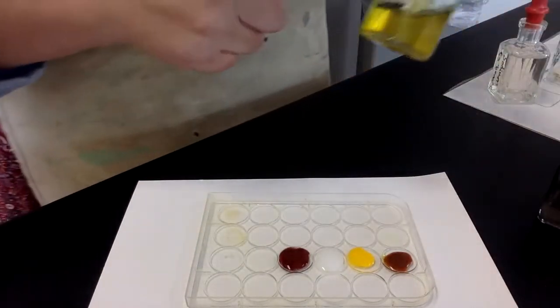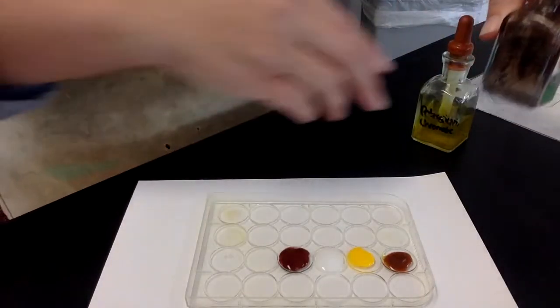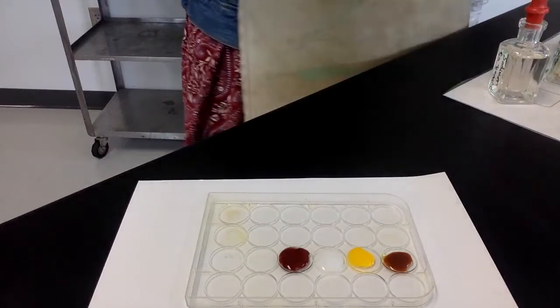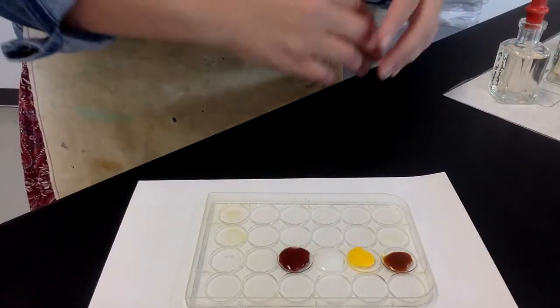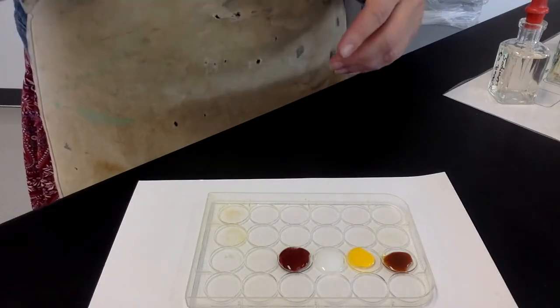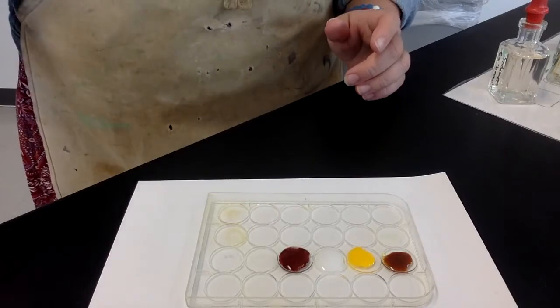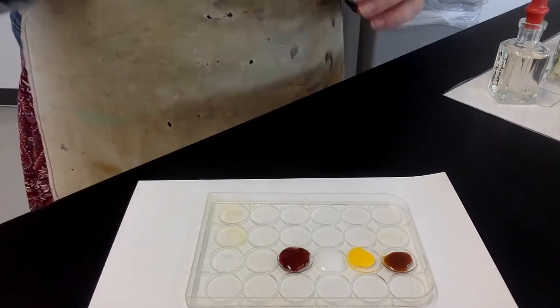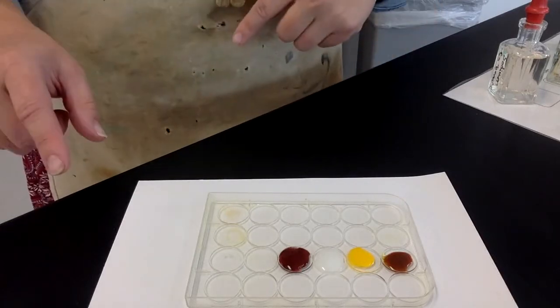Your 4 ions are potassium and chromate, silver, and nitrate. So those are your 4 ions. Write the original formula, switch the partners, and then you write the new compound. The new compound that is with NO3 is soluble because nitrates are always soluble. The other compound that's not with NO3, the new one, that is your precipitate.